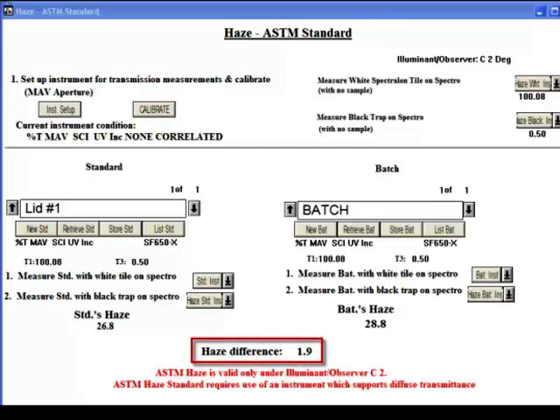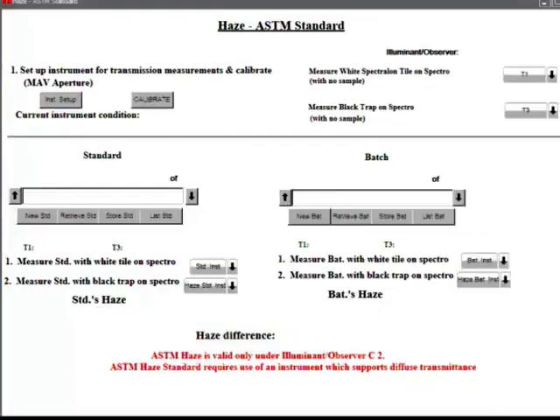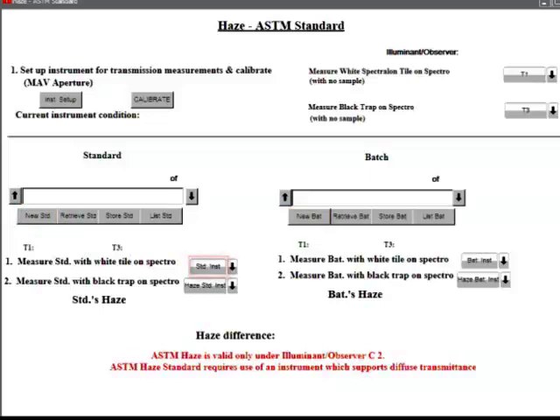Additionally, the comparison of the two samples' haze will be displayed at the bottom of the screen form labeled Haze Difference. In Tools Version 2, the New Standard and New Batch buttons are inactive. Just use the Standard INST and BAT INST buttons in the lower part of the screen form.